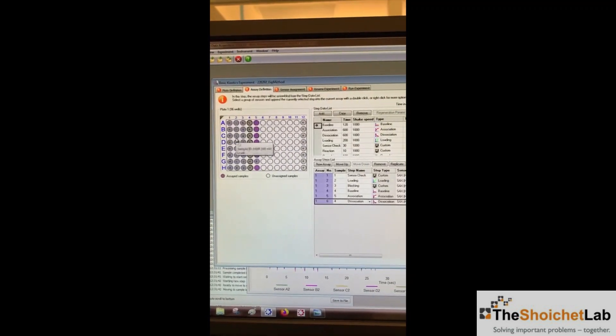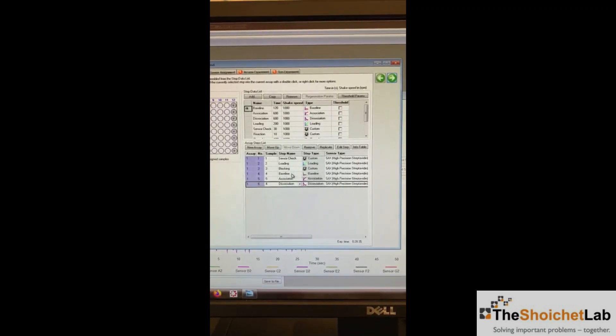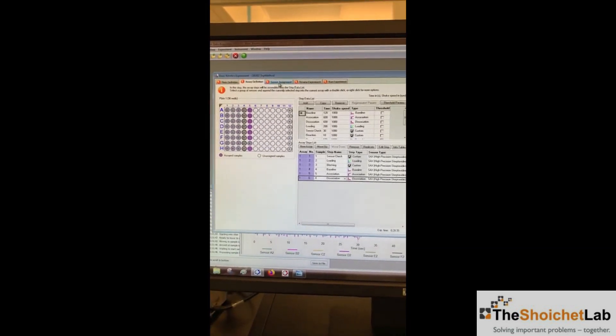In the software, we are able to input the sensor check, loading, blocking, baseline, association, and dissociation steps. Afterward, we need to select the position where the sensors are going to be located and the type of sensor.